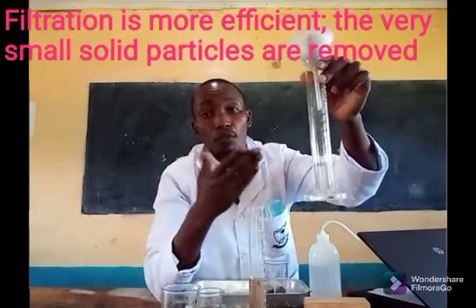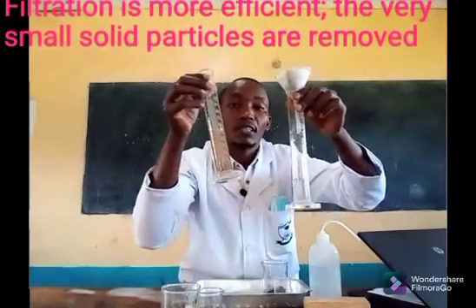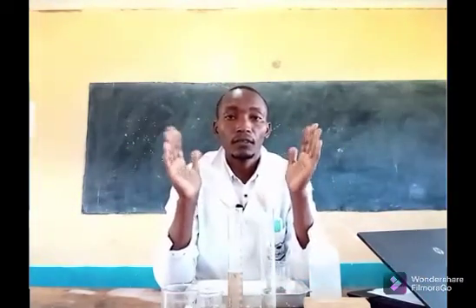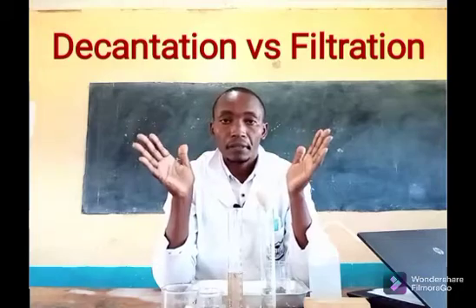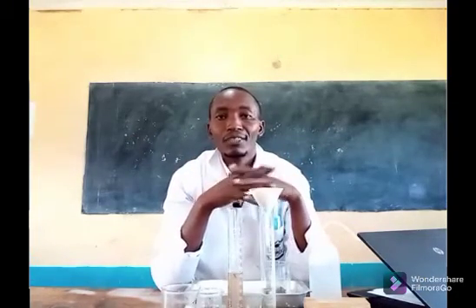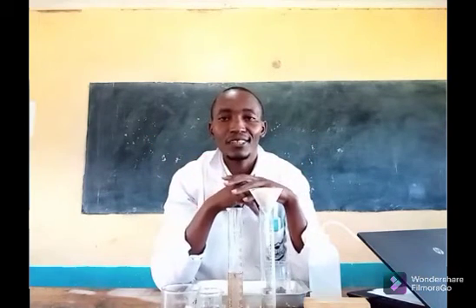So with that, we conclude that filtration is more effective compared to decantation. The reason being, with filtration, we are able to remove even the smallest solid particles from the mixture. With decantation, the very small solid particles cannot be removed. That is the comparison between decantation and filtration.